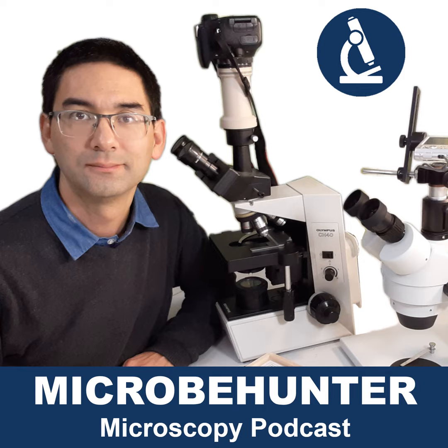The 160mm standard has been around quite a long time, and this means that on every microscope that has this standard, you can exchange the objectives. The threading is also standardized. It's a so-called RMS threading, from the Royal Microscopical Society. They once defined this, and you can essentially exchange the objectives. Having said that, if you exchange the objectives, they all have to be from the same series. It is quite possible that if you attach a new objective to the microscope, even though it does fit, the image might be out of focus compared to the other objectives. So this is something that you might want to consider.